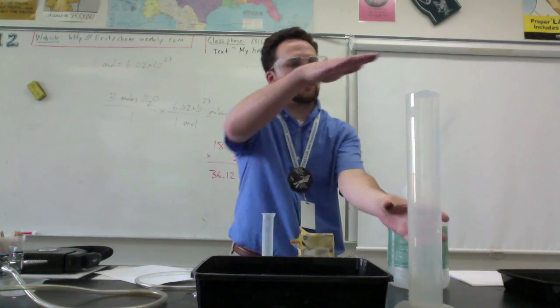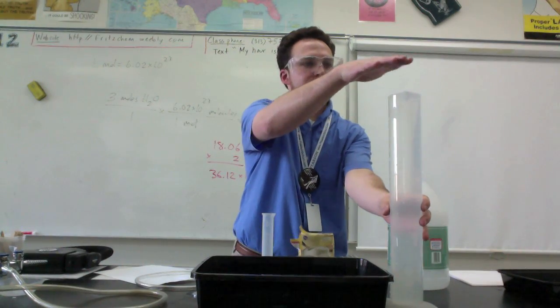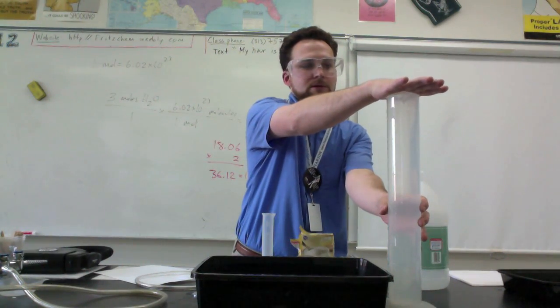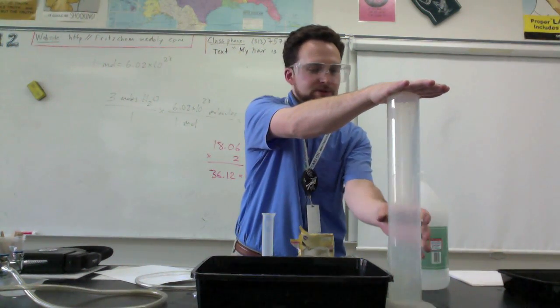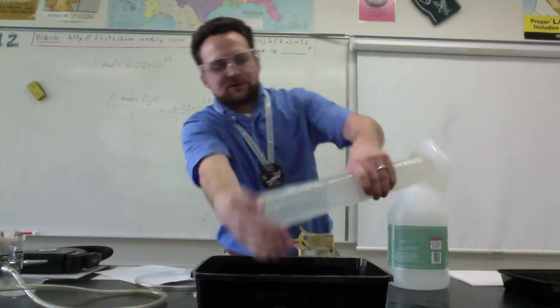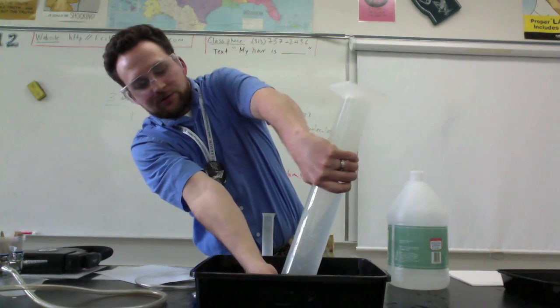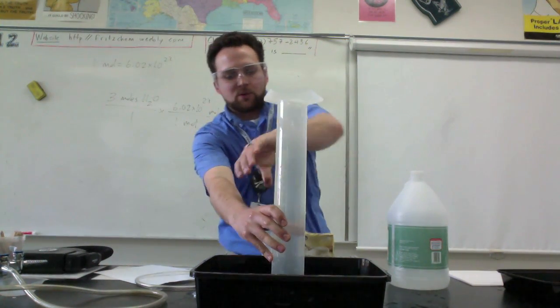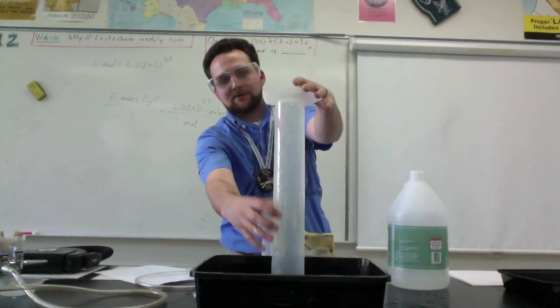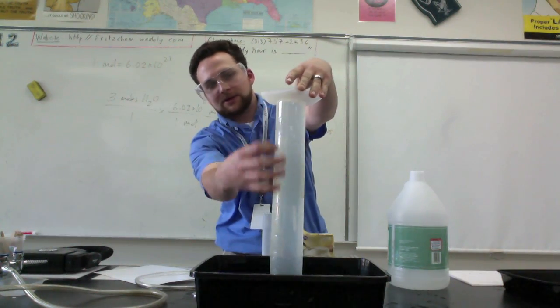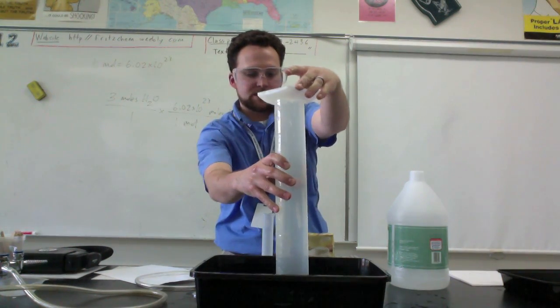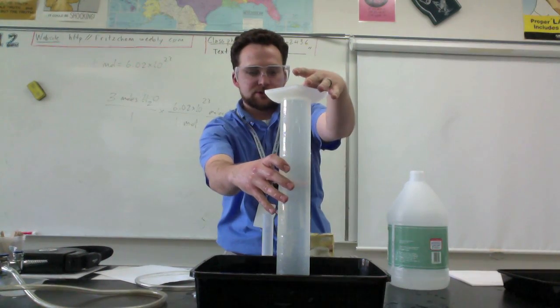Basically what I'm going to do first is take this graduated cylinder, cover it with my hand. If a little water comes out, that's fine. Cover it with my hand, flip it over as fast as I can, make sure that the graduated cylinder is under the water, and then take your hand off so that now I've trapped all the water in here. You notice it's not coming out or anything. So first, that's the first thing you want to do, make sure it doesn't tip over.